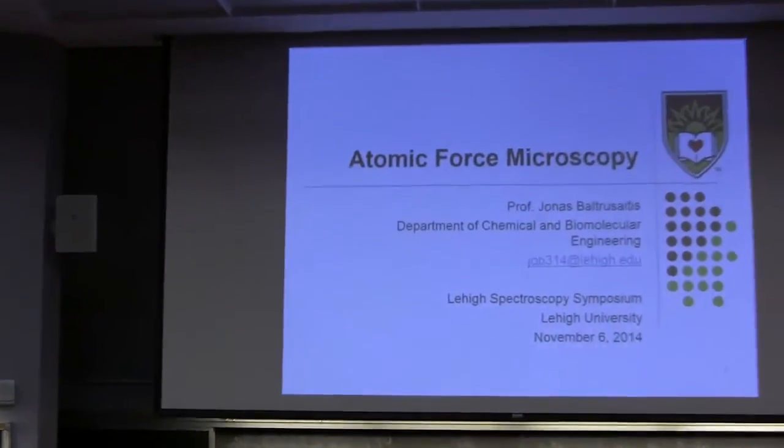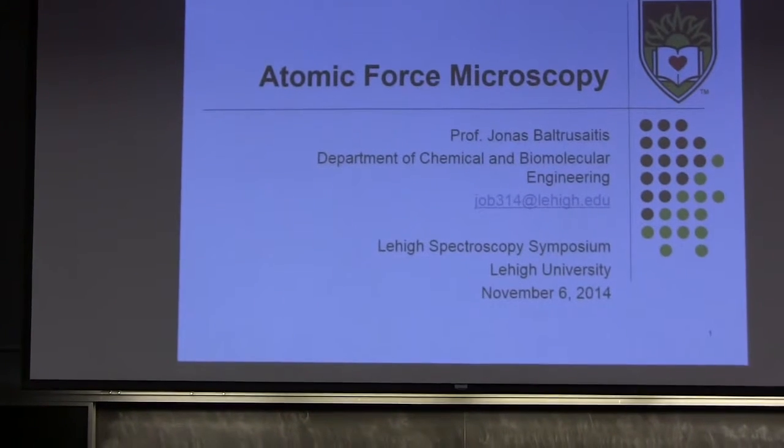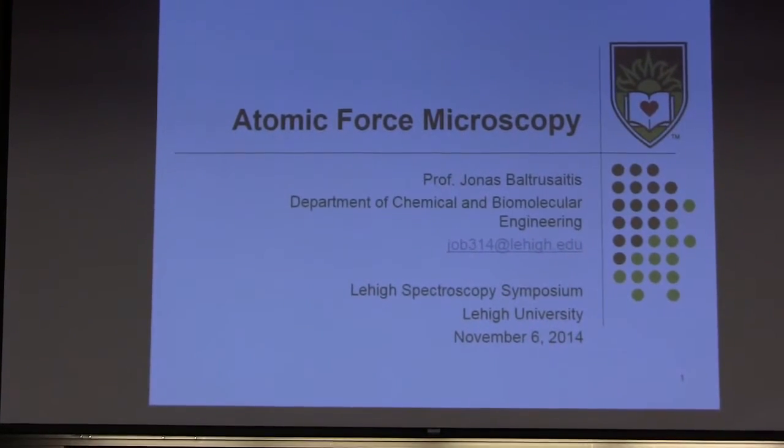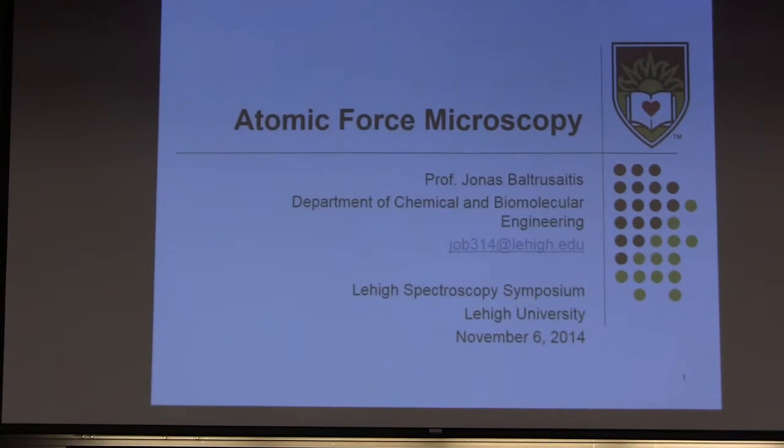Okay, so for the next 20 minutes, we'll be talking about AFM spectroscopy. It's sort of this old new thing, right? It's been around since the 80s. In some places, it really picked up. In some places, it didn't.